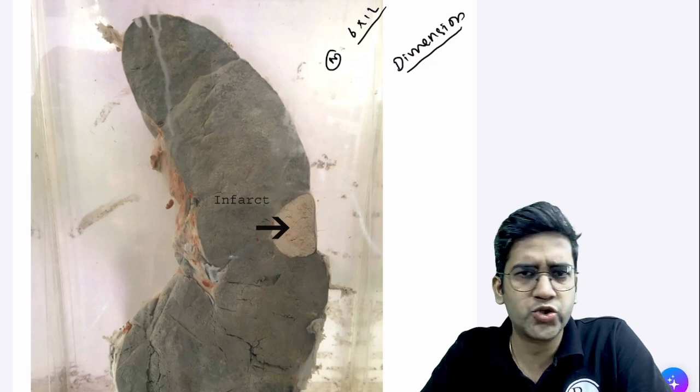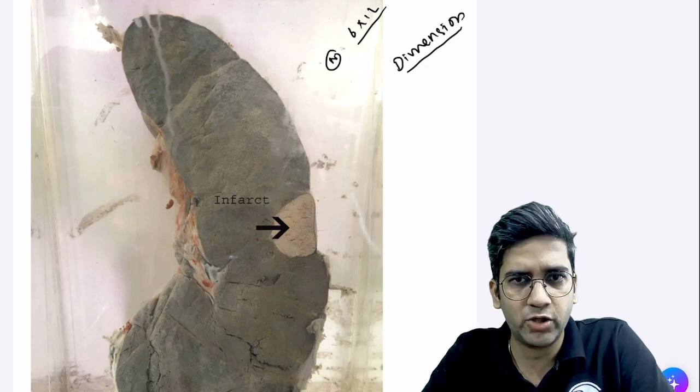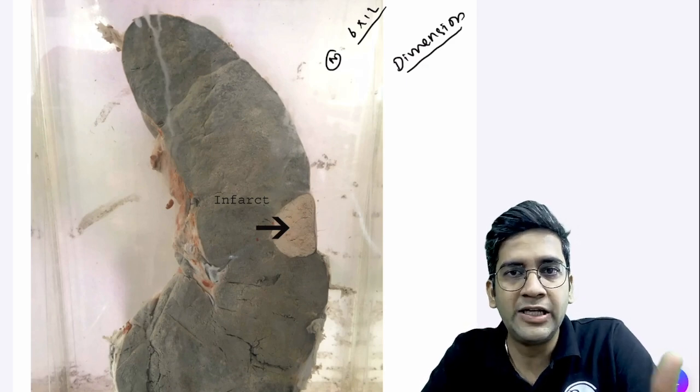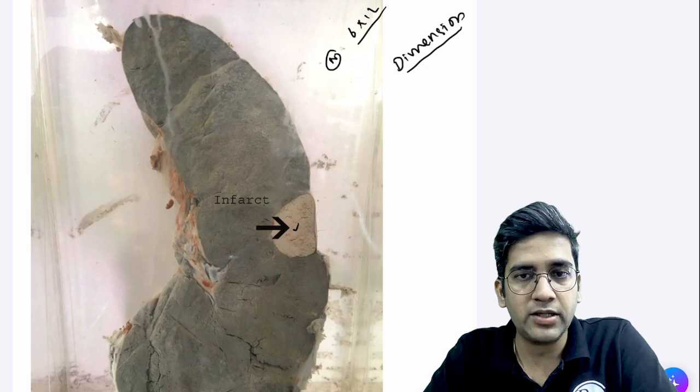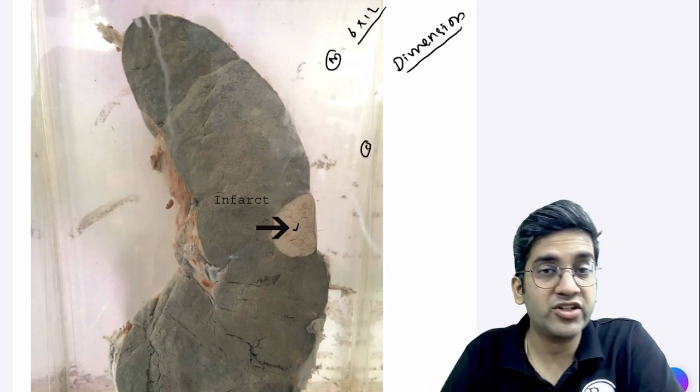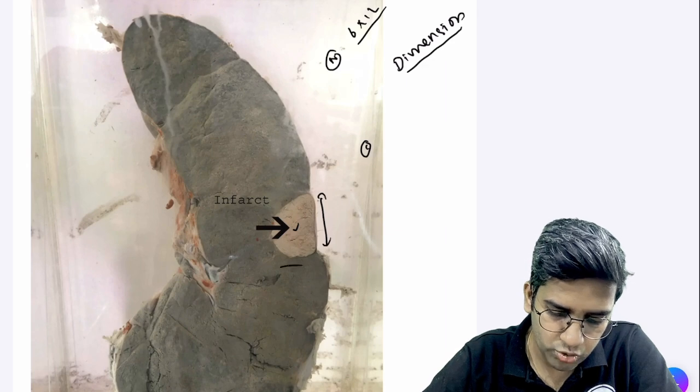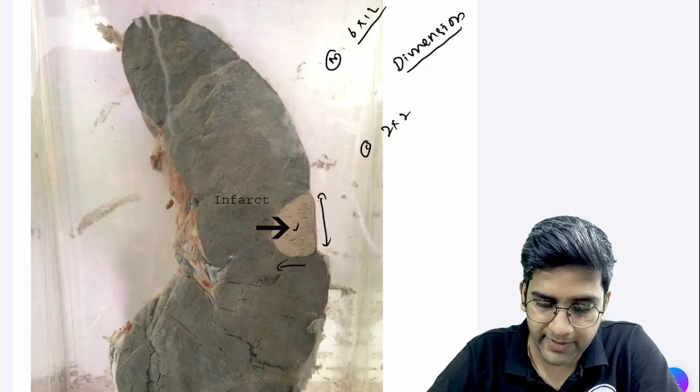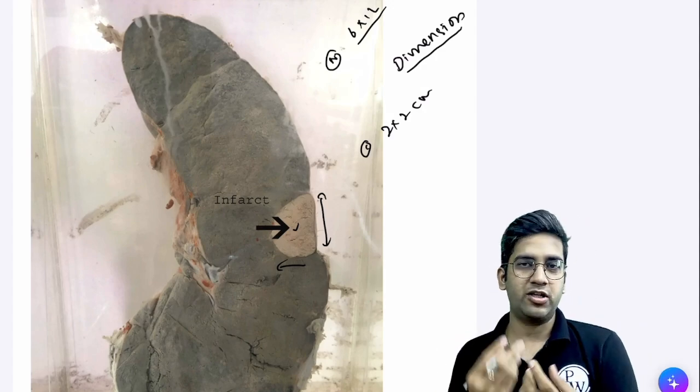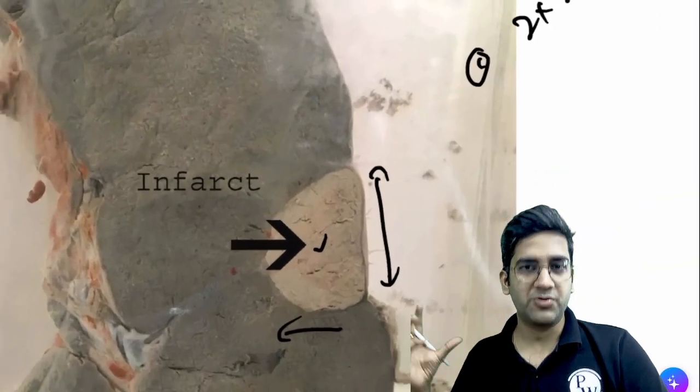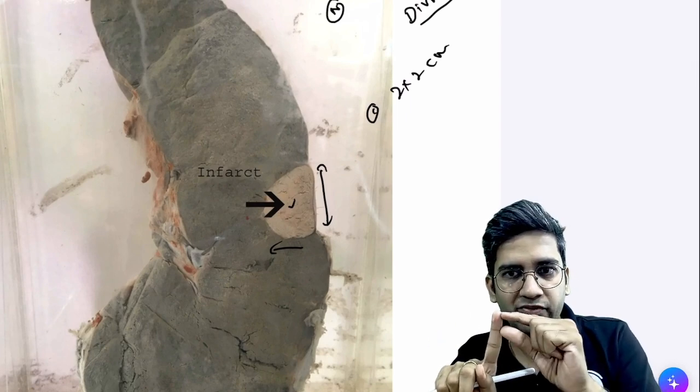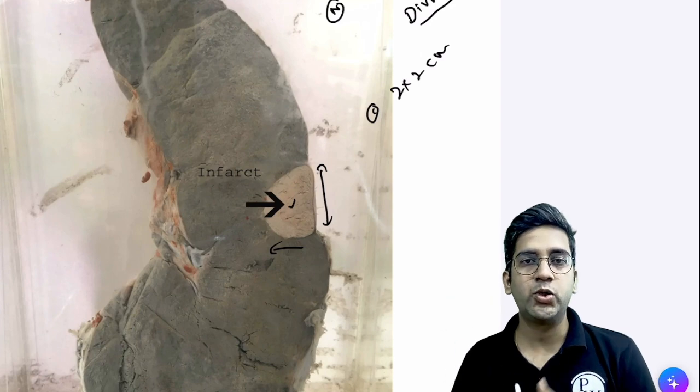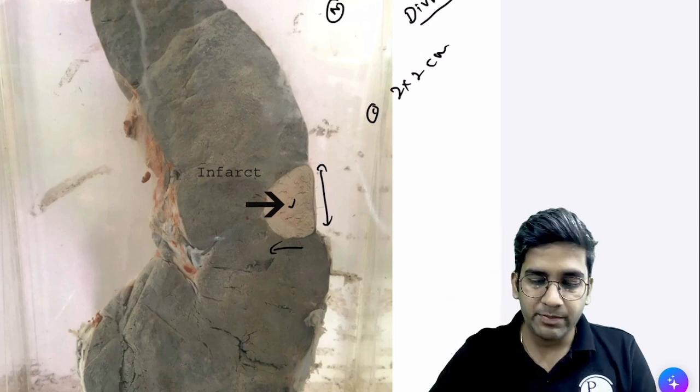Now in the cuts of the spleen, most of the areas of the spleen look perfectly normal, but there's an area in the middle of the spleen—I feel it's a bit of whitish color. Once I look at it, I mention the size of the whitish lesion: maybe a 2 into 2 centimeter lesion. I'm saying all the approximate things because from the photo I cannot exactly measure—if I zoom in it becomes bigger, zoom out it becomes smaller.